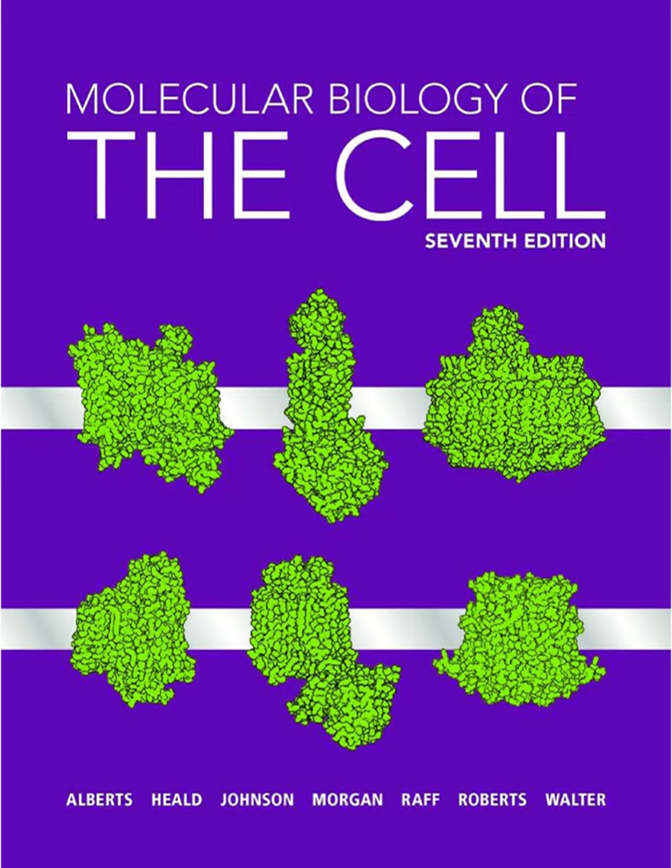One way is to image your sample first with fluorescence microscopy, maybe live cell imaging, or immunofluorescence on fixed cells, to find your event or molecule of interest. You record its coordinates precisely. Then, you process that exact same sample for EM, relocate the same area, and acquire EM images or a tomogram. And overlay the fluorescence signal onto the EM structure. Yes. You correlate the fluorescent spot with the underlying ultrastructure seen in the EM. That green dot corresponds to this specific vesicle. It requires careful sample handling and finding the same spot again. Sounds challenging. Is there another way?